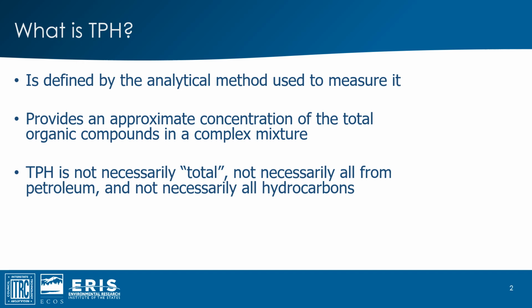First, unlike a single chemical where the concentration will be fairly predictable across different methods, TPH is actually defined by the analytical method used to measure it. In other words, depending on what method is used, the analytical result can vary significantly.